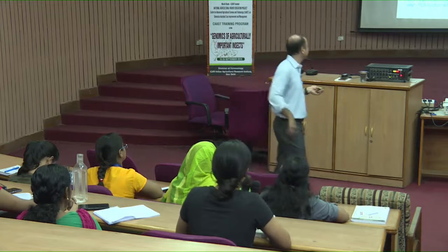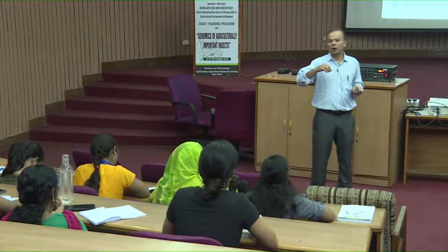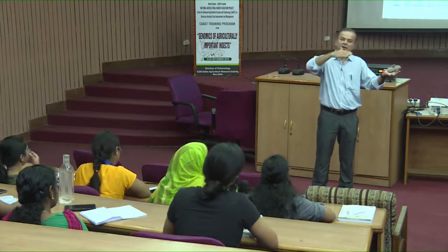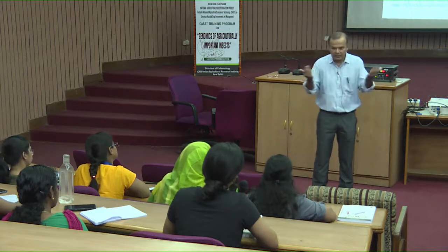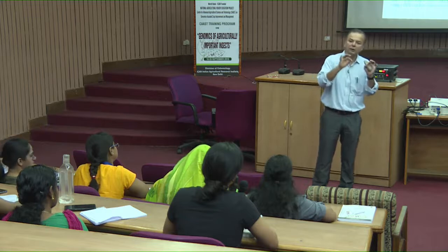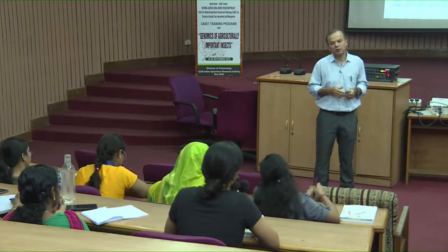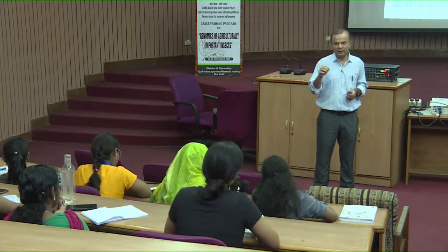Yeah. See, as I said, one of the sources of variation is that you cannot afford to have differential amounts of mRNA in different reactions, isn't it? So, those precautionary steps are already there. These are standard practices: when your purpose is comparative gene expression study, you have to make sure that you are taking equal amount of RNA. And how do you make sure that you are taking equal amount of RNA? You have to use a spectrophotometer or nanodrop to quantify each sample, isn't it?